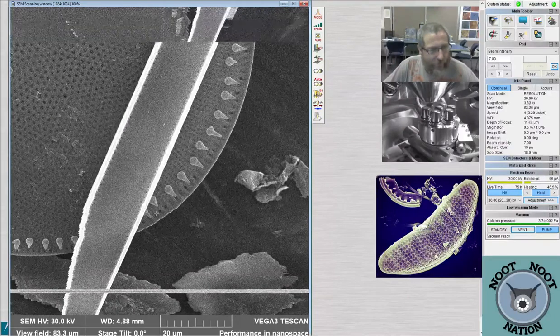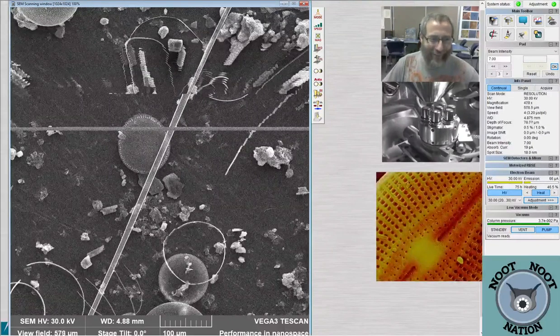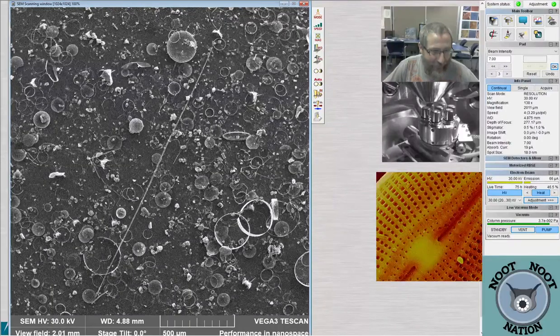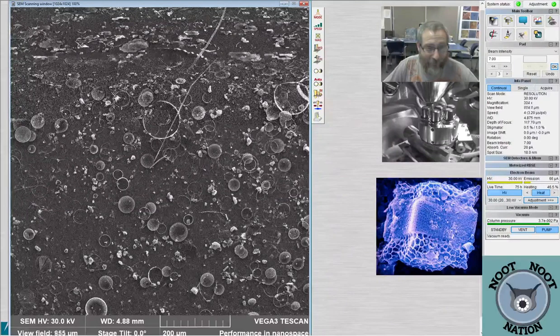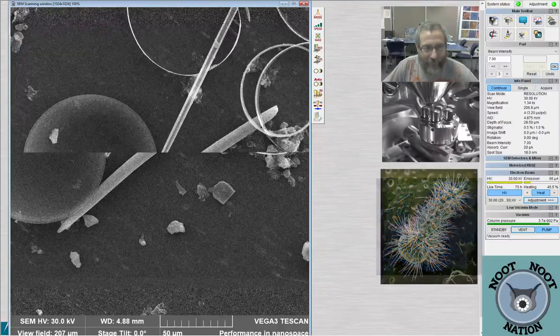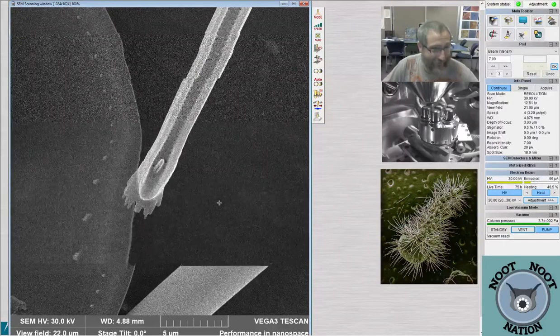I want to see the ends of that crazy long one. Okay, I'm going to see if I can find an end. Can you find it? It's huge. It's unreasonable. I think that's the end. It's whole, which is really cool. It didn't break. Pangolin says it's the monorail diatom that other diatoms take to work. It does have pretty cool ends, actually.